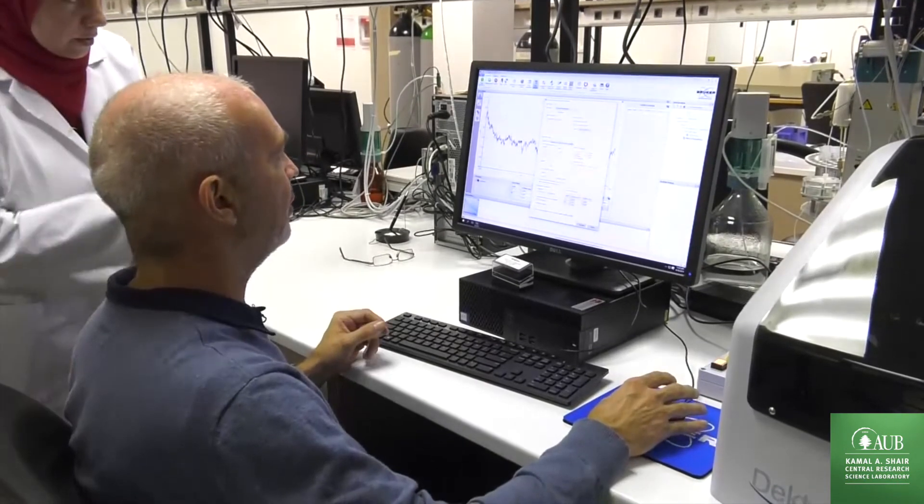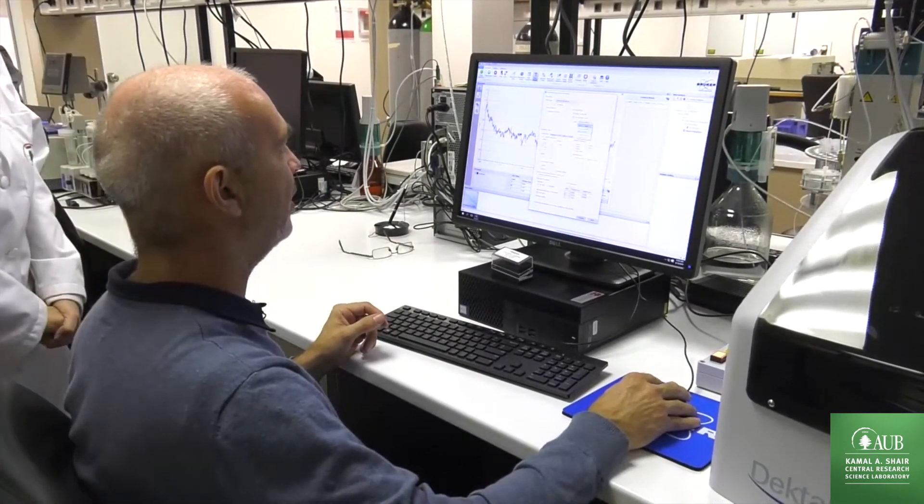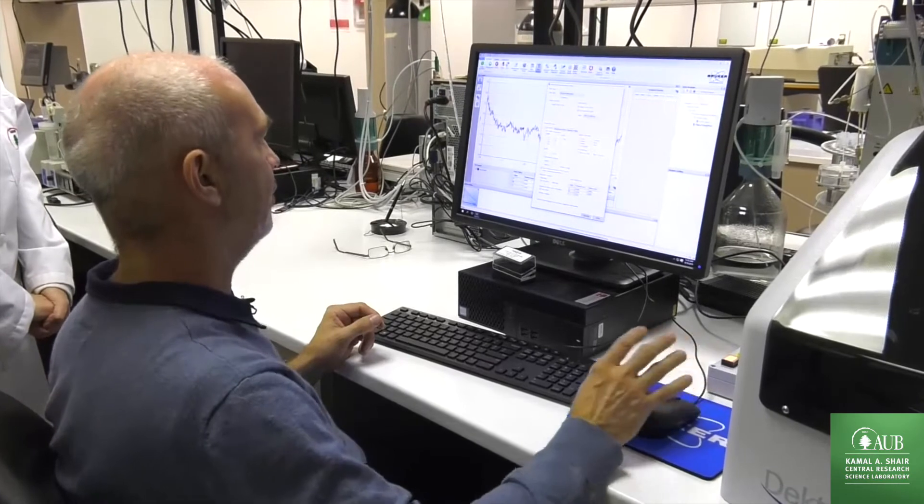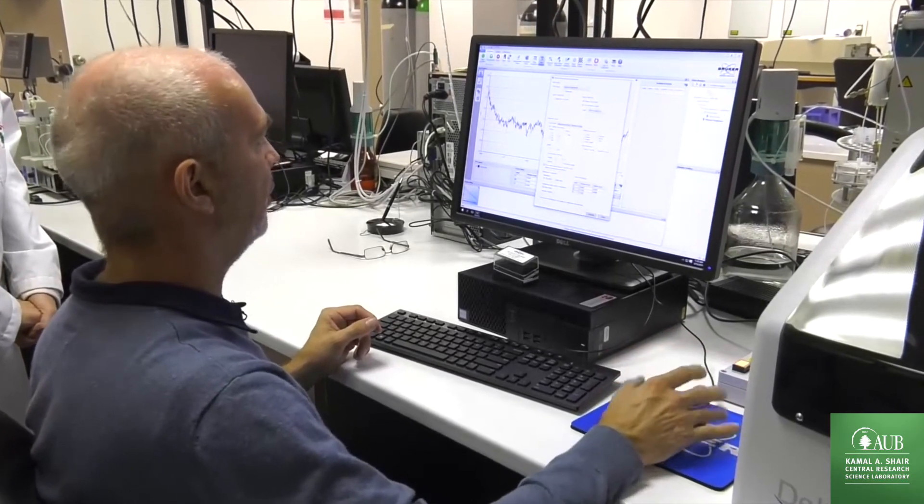Since our roughness, the roughness will be very small, I take the smallest cutoff wavelengths. I will have to check that later, but I expect that this will be the correct value.